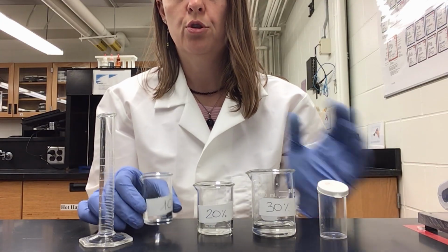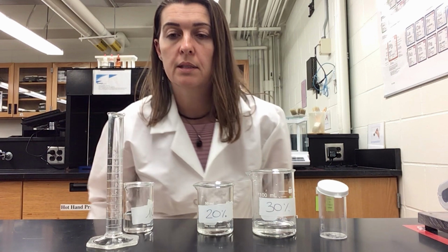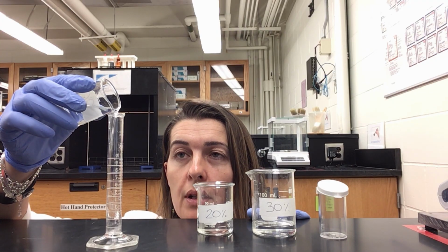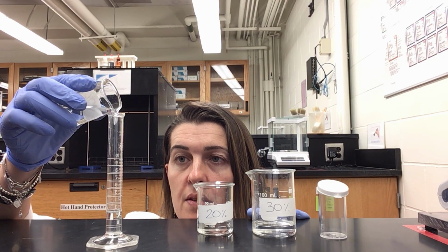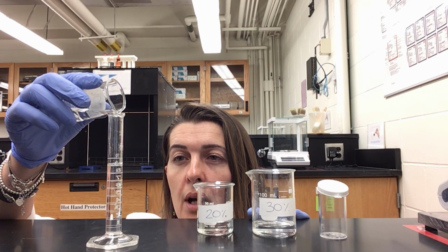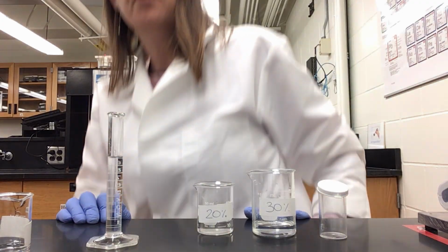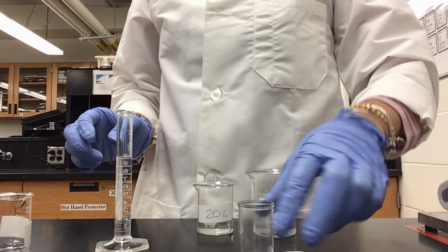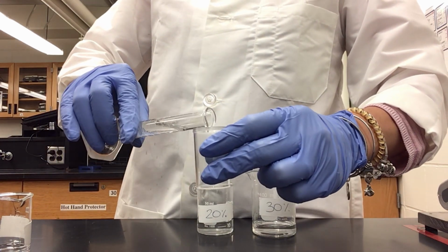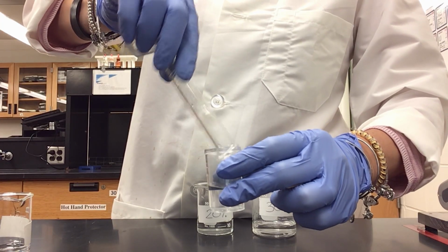Now that we established why we are using these and not the pipette, it's time to measure 10 milliliters of each solution using the graduated cylinder. So now I am going to kneel and very carefully drop the 10% solution inside the cylinder up to the 10 milliliters mark. Very carefully, you don't want to go higher than 10. So the meniscus is right at 10 right now. So now I can take these. Remember that we already know the weight of the plastic vial with its cap. I am gonna drop it entirely here. Make sure that nothing remains in the cylinder.